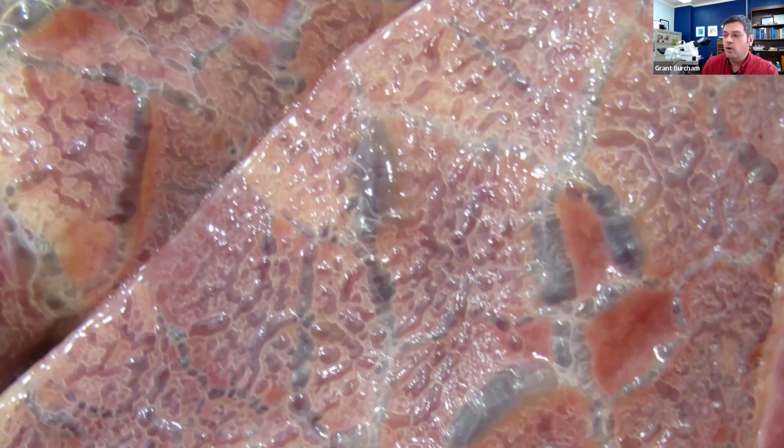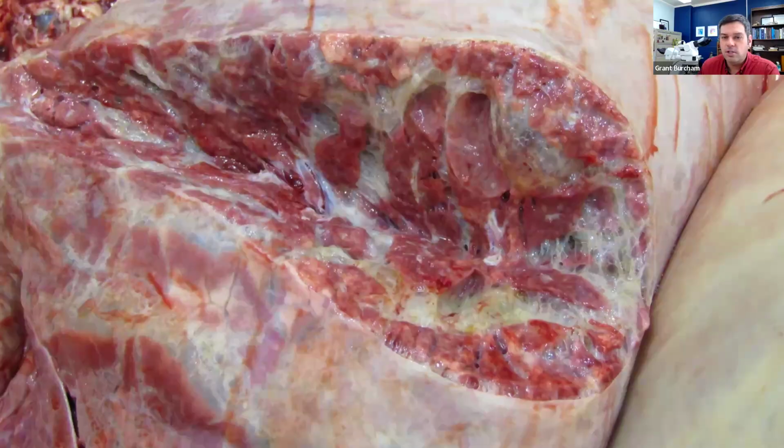And that can occur because of really forced respiratory effort, where air will rupture air sacs and come into interstitial tissues. So this is a cut section of the lung. The rest of the lung becomes very collapsed and firm or rubbery. And then there's air within the interstitial spaces. So this is another section of emphysema, illustrating emphysema in this particular heifer. So not good. This is why she died. She had pretty severe pathology throughout the lungs. And it's difficult to tell here because you can't see the whole thing, but on at least this cross section, most of the lung is pretty severely affected.